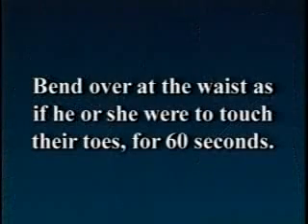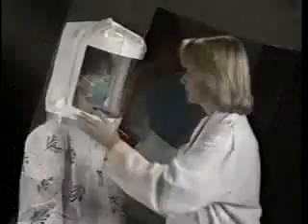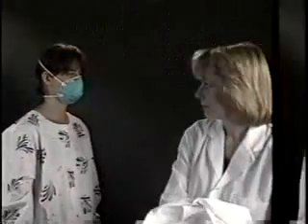Finally, have the subject bend over at the waist, as if he or she were to touch his or her toes for 60 seconds. Conclude by asking the subject to breathe through their mouth normally again for 60 seconds. If the fit test is completed without the subject detecting the sweet taste of the aerosol, an adequate face seal has been demonstrated with that model of respirator.